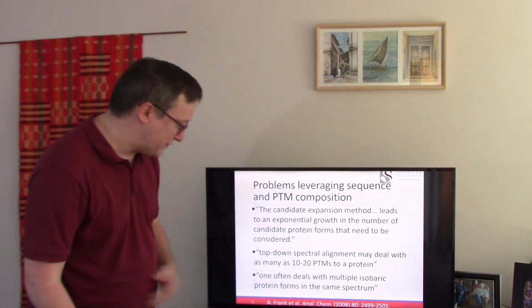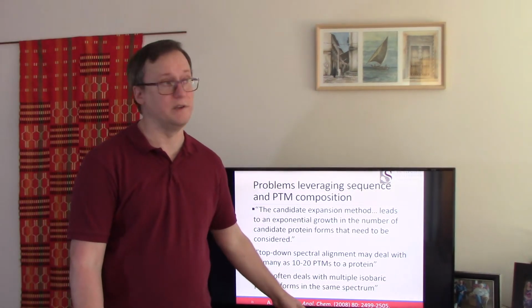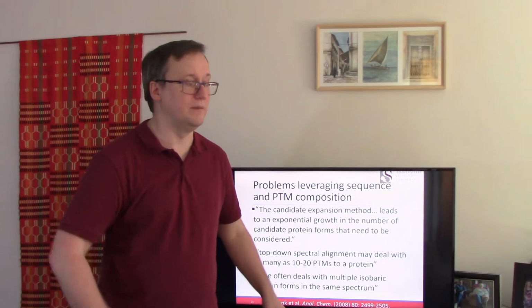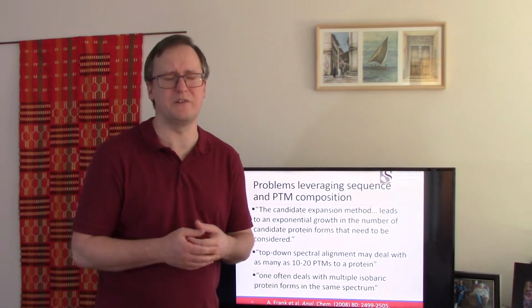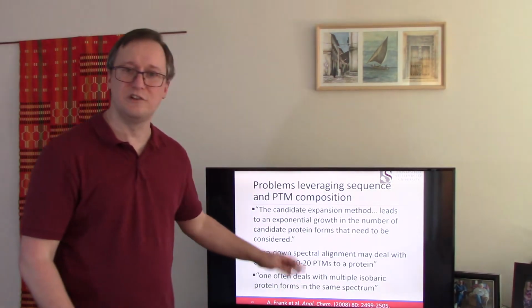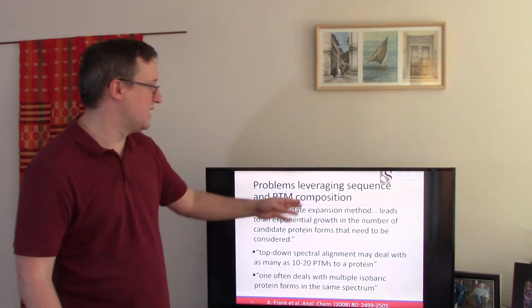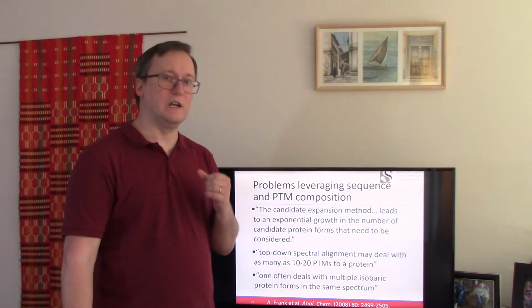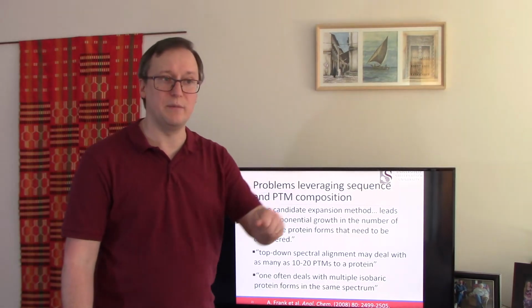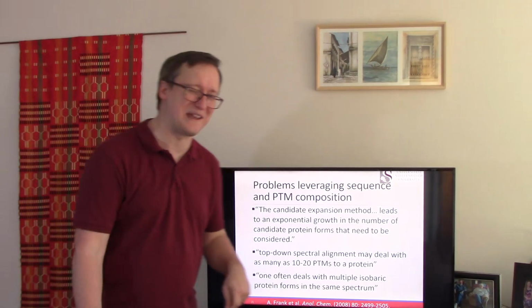Now there's a great paper from 2008 from Ari Frank et al. This is yet another mention for the Center for Computational Mass Spectrometry at University of California, San Diego. Just one of their papers to show how to make sense of these data. So they found that there are a lot of issues that come into play when PTMs come into combination with proteoforms, what we now call proteoforms. That term didn't exist back then.